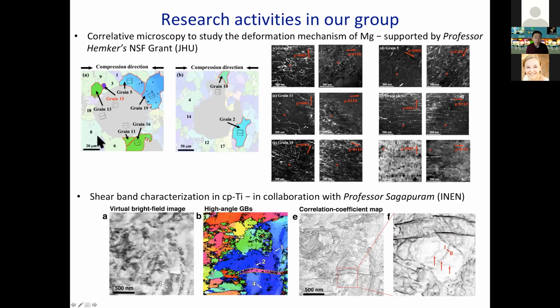The two micrographs you see on the left are the EBSD maps we acquired at MCF. What EBSD tells you is the crystal orientation information. In the example here, we also know the loading direction. So for each crystal here, we can calculate something we call the Schmid factor of individual grains. By knowing the Schmid factor, we can predict what kind of deformation mechanisms should be activated.